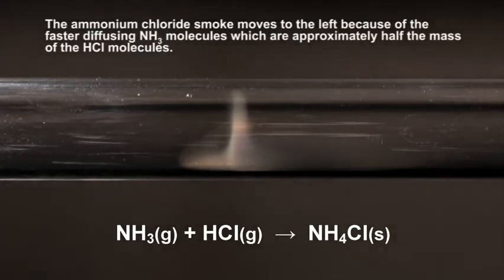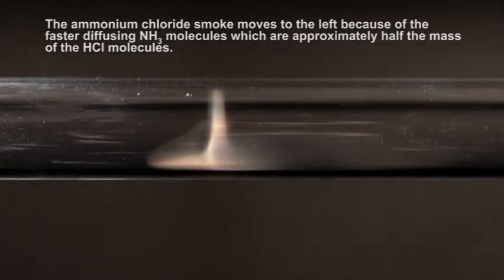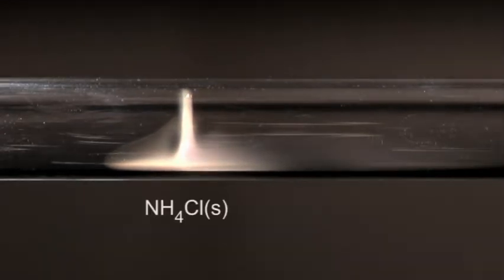not formed in the middle of the tube because ammonia molecules travel faster than hydrogen chloride molecules. The faster moving ammonia pushes the ring of ammonium chloride to the left.